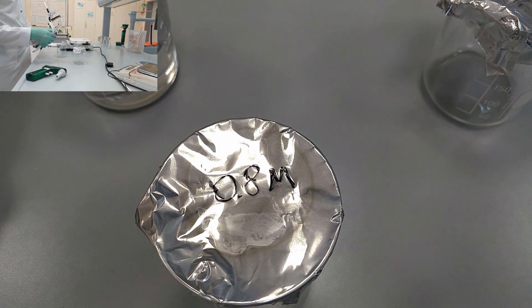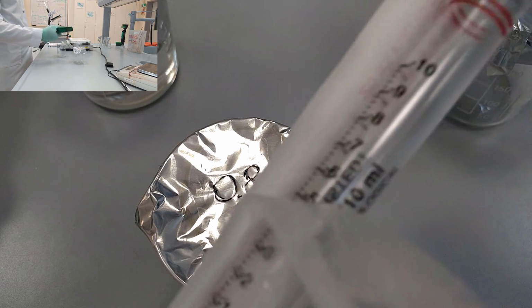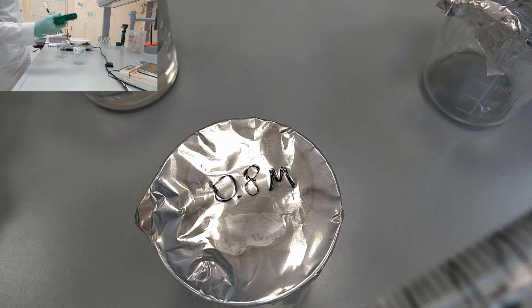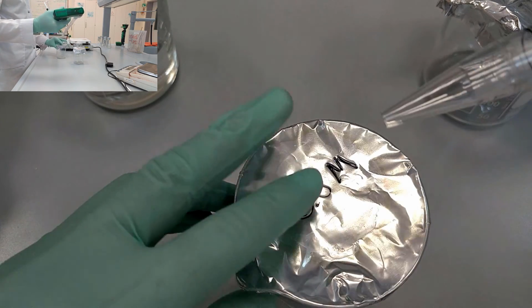So the first step here would be taking 30 milliliters of the more concentrated solution, transfer it to the beaker, and then add 15 milliliters of water.